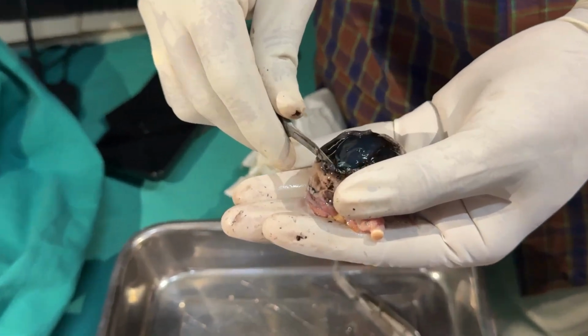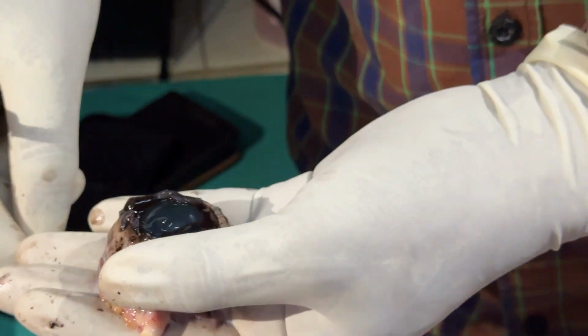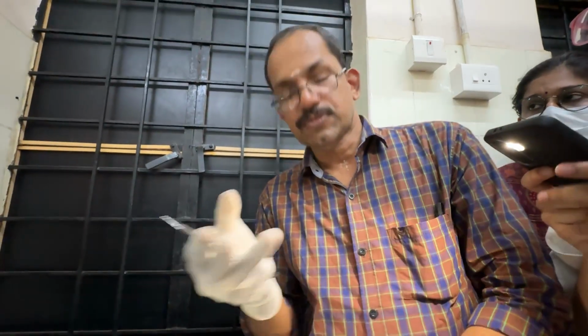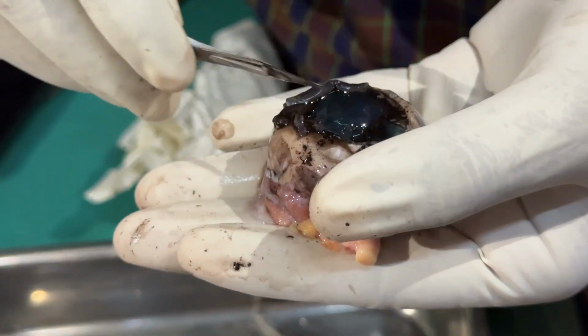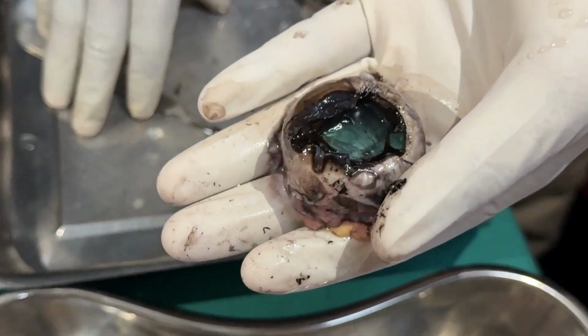The problem is when we are removing the lens, it always drags the vitreous along with it, as it is connected to the Cloquet canal from intrauterine life. And this vitreous is attached to the retina, so altogether it will come back. Whenever we are doing surgery like PPV or vitrectomy, usually the retina will get detached. You can see that we are taking the lens. This is the optic disc and the optic nerve.